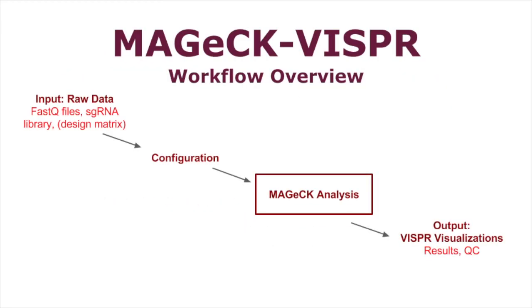In the previous video, we showed you how to download and set up the workflow. In this video, we'll demonstrate how the process works from inputting raw data to configuring the workflow to getting to VISPR's visualizations. We again recommend that you follow along and complete each step as it is being shown in the video. Since the process is slightly complex, we also recommend that you follow the demo exactly the first time you watch and adapt it to your own needs later.